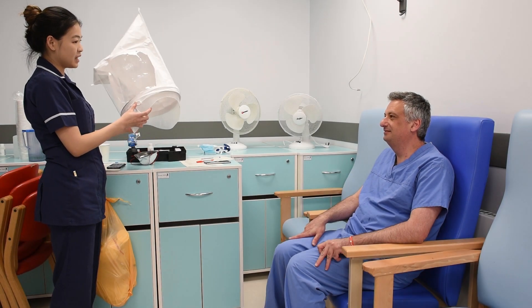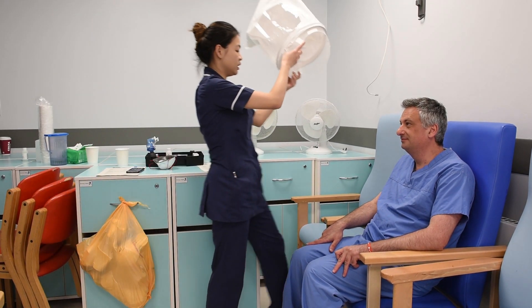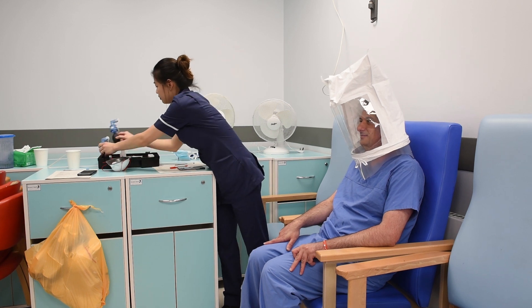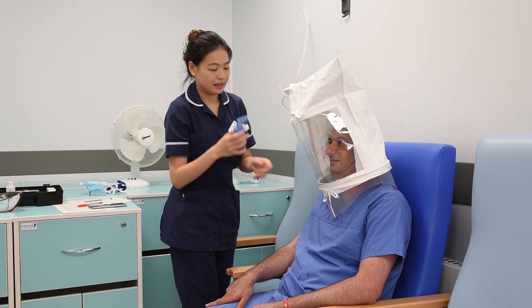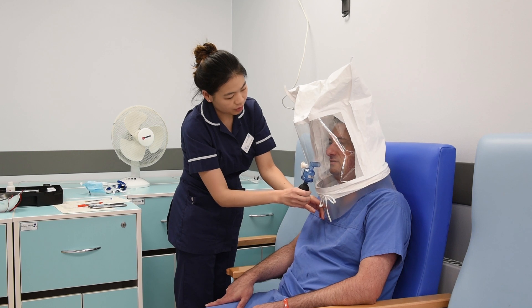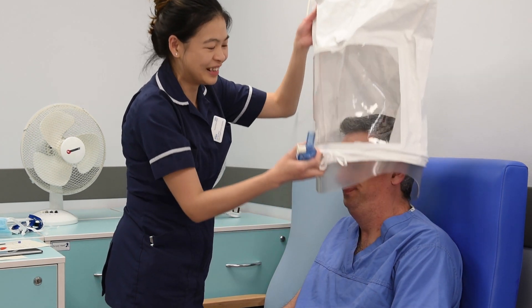We're going to do the first test, which is the sensitivity test, to figure out how sensitive you're going to be for the solution. So just take a deep, long breath through your mouth and let me know when you taste something. That's great. So that's normal sensitivity.